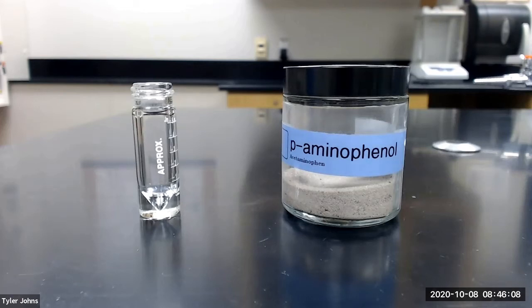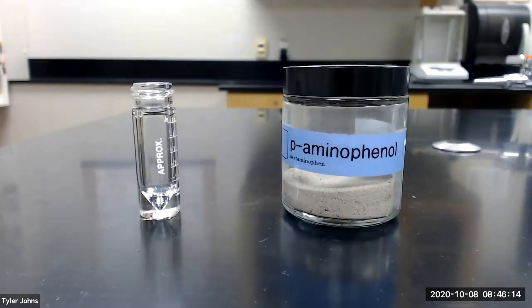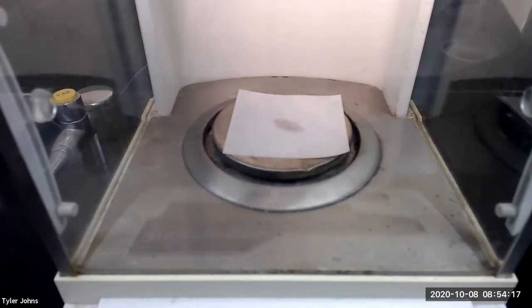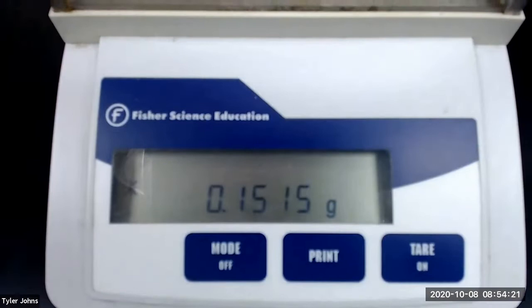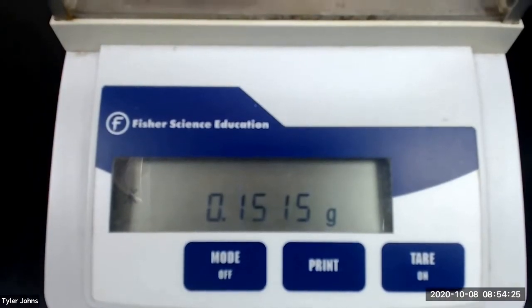The first thing we need to do is weigh out approximately 0.15 grams of P-aminophenol and transfer to a 5-milliliter conical vial. The mass of P-aminophenol that we will be using is 0.1515 grams.